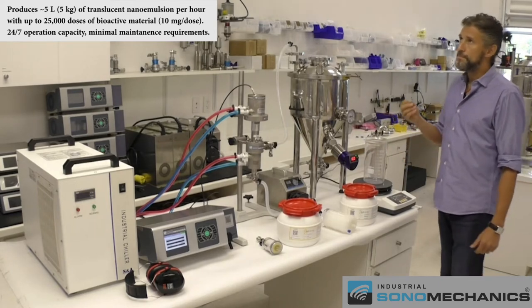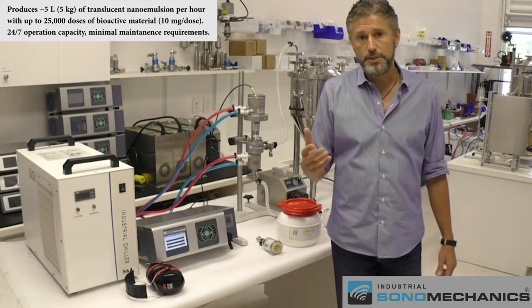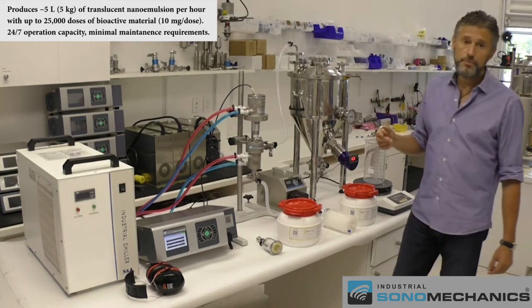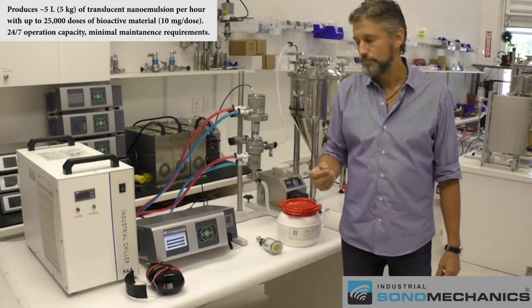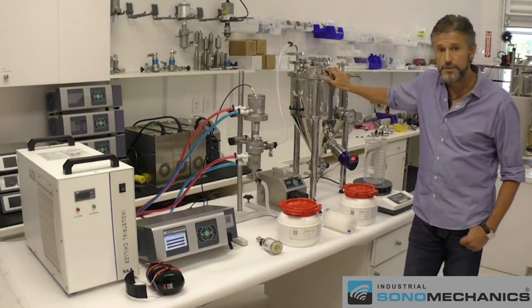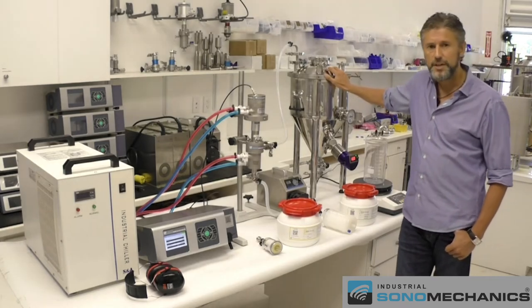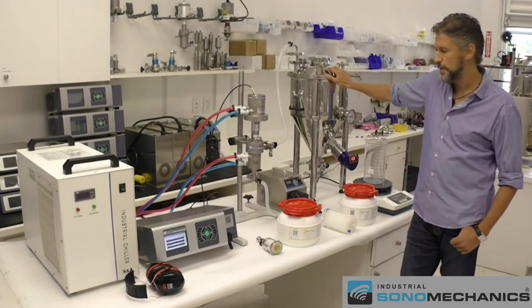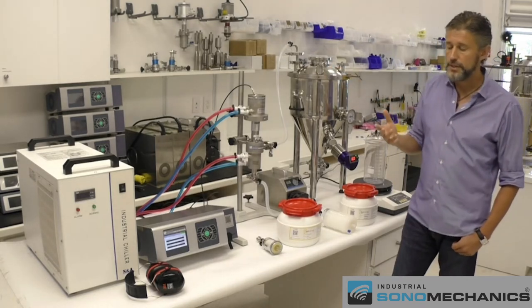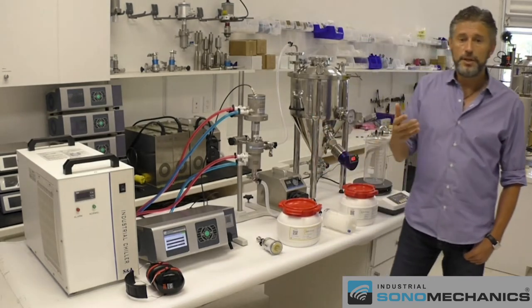So if a dose of the bioactive is 10 milligrams, which is typical for cannabis extracts for example, then in one hour you can make 25,000 doses with this unit. The unit can be used with a wide range of bioactives such as cannabis extracts, oil-soluble vitamins, pharmaceuticals, and nutraceuticals. The only common requirement is that these bioactives have to be lipophilic or soluble in oils.